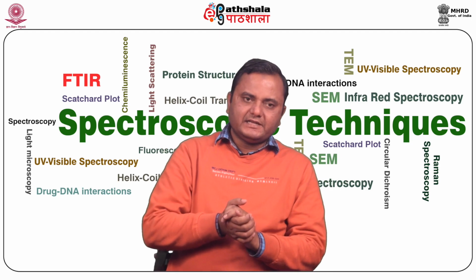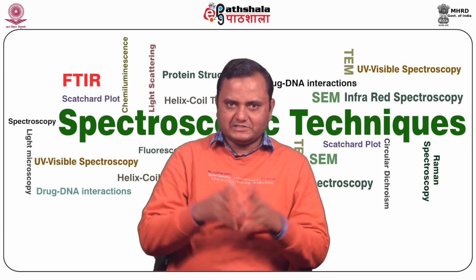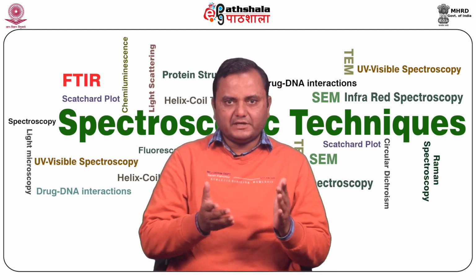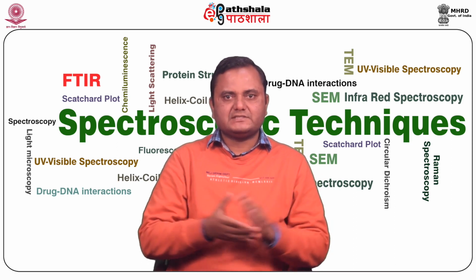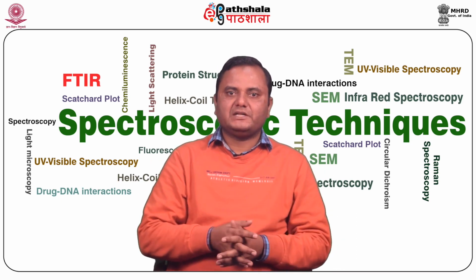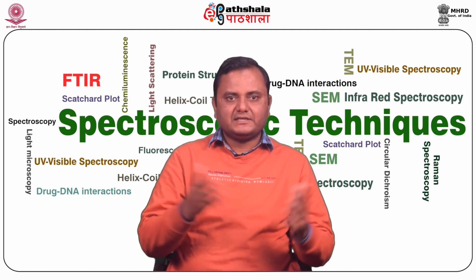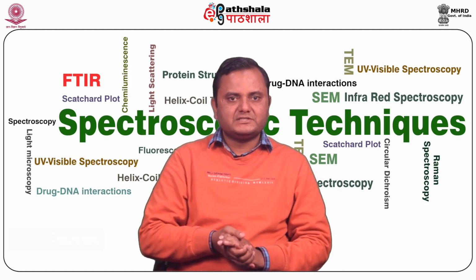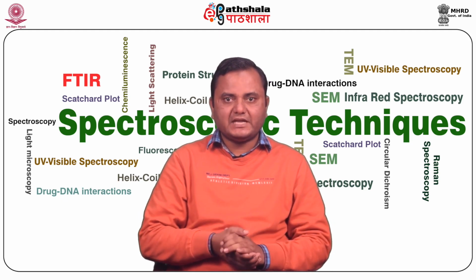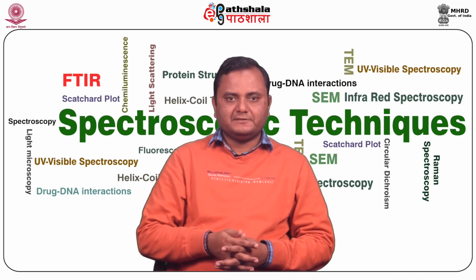Fluorescence is greatly affected by the environment. That's why it is used to investigate changes in the environment of biological molecules. So for example, pH, as I already discussed, influences the ionization state, and that changes the conjugation property and aromaticity of the compound, and that affects the fluorescence. The solvent also affects the fluorescence through its ability to stabilize the ground state and excited state differentially, thereby changing the probability and energy of both absorption and emission.